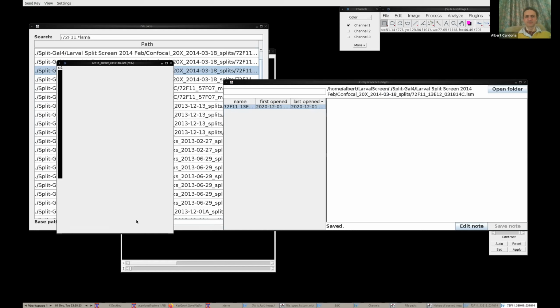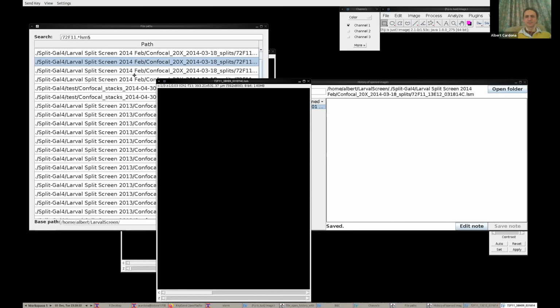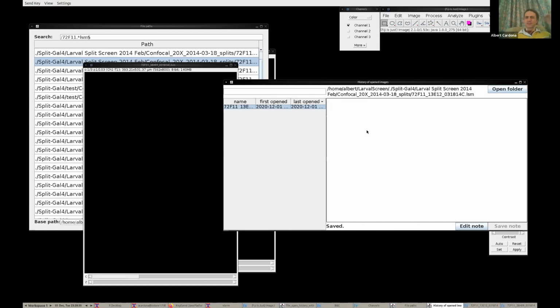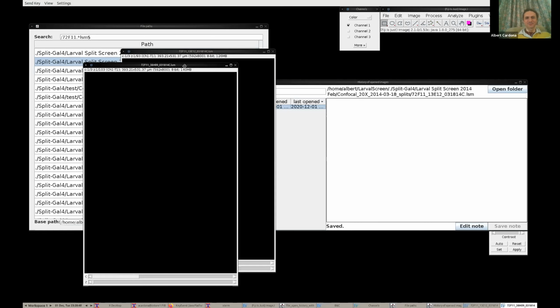There's something that went wrong with this file, and I have no idea why. Okay, here it is. What I'm seeing is that somehow it's not adding the files. Why is this failing now? This should be adding 1 row per every file that I open. And this was working before, and now it doesn't want to work.